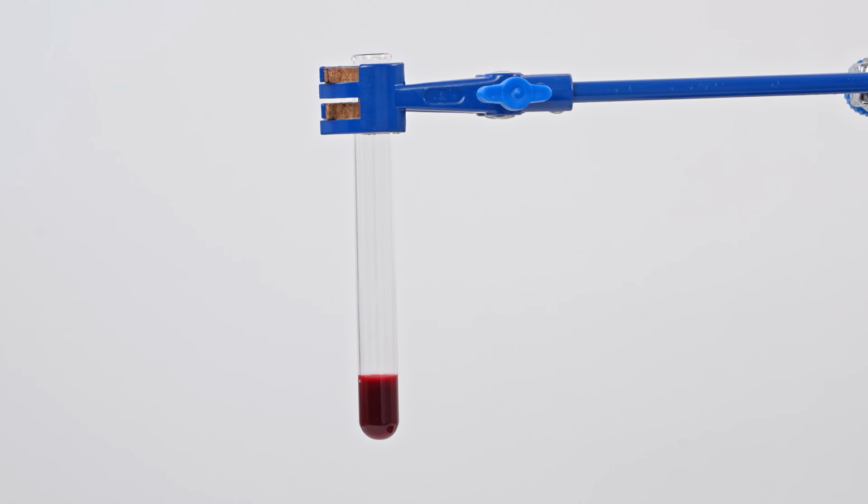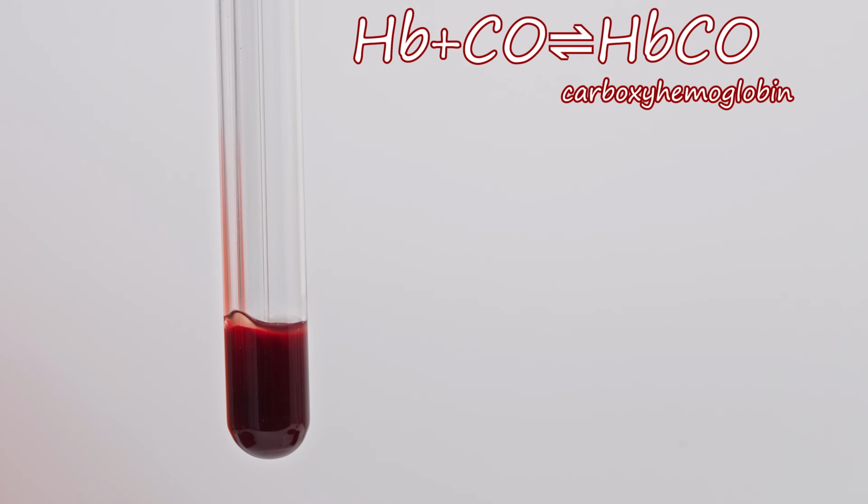Carbon monoxide has a unique reaction with hemoglobin, forming a stable complex called carboxyhemoglobin or carbonyl hemoglobin. I've always been curious to see how the blood color shifts with carbon monoxide. So here we go. I slowly begin to pass carbon monoxide through the blood.